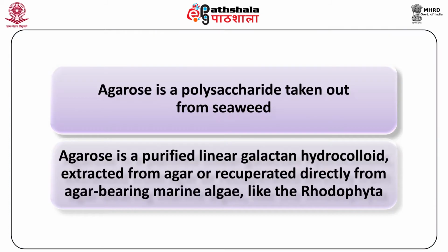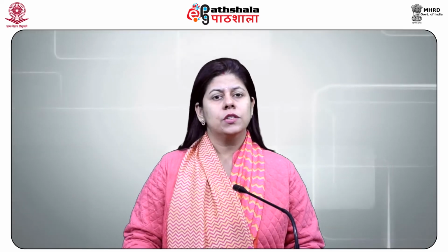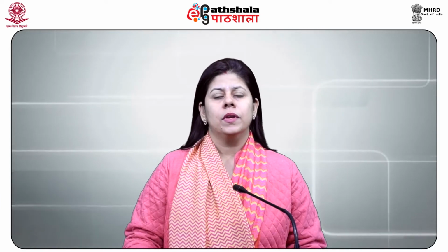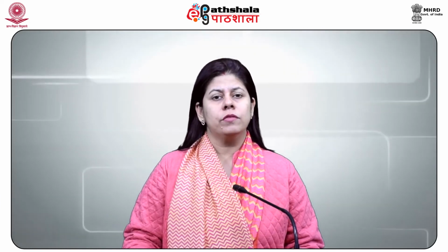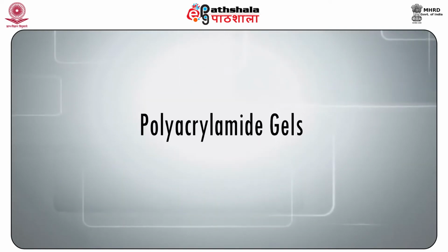Agarose gels. Agarose is a polysaccharide taken from seaweed. Agarose is a purified linear galactan hydrocolloid extracted from agar or recovered directly from agar-bearing marine algae like Rhodophyta. Agarose gels are extremely easy to prepare and also non-toxic. They have an extensive range of separation but comparatively low resolving power.